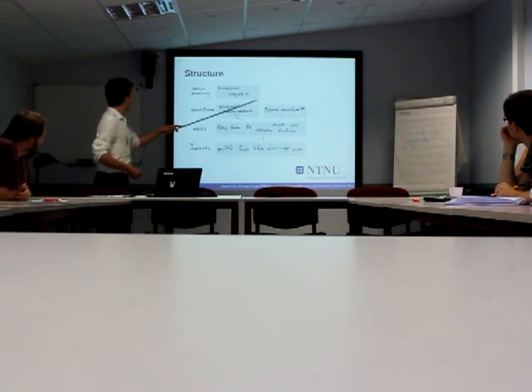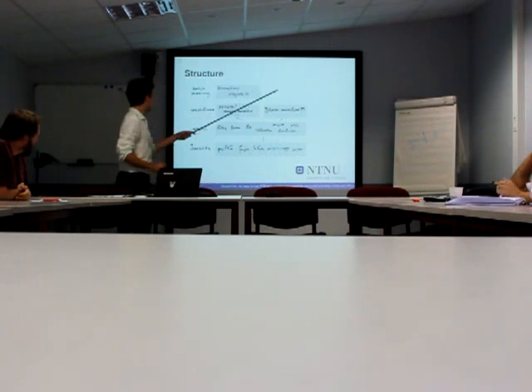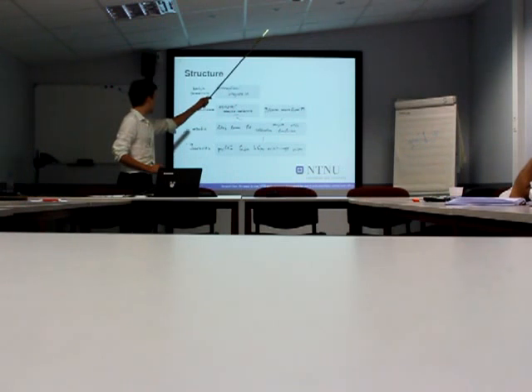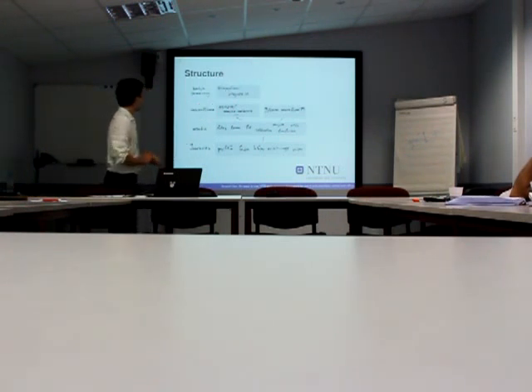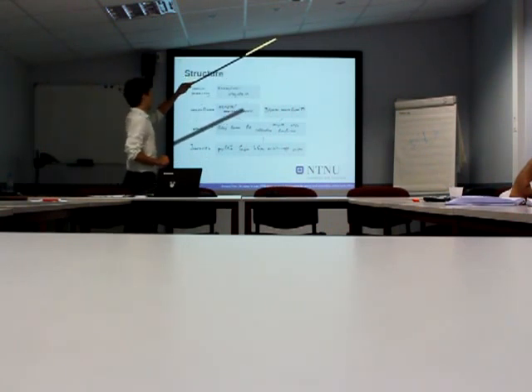So we have these external libraries at the bottom that provide quick integration, file access, image manipulations, and so on. And on top of this, I made some utility functions. The X-Ray lib, which is a Python module that you can import, and you try to put all the functionality there, which you then use in the different scripts.